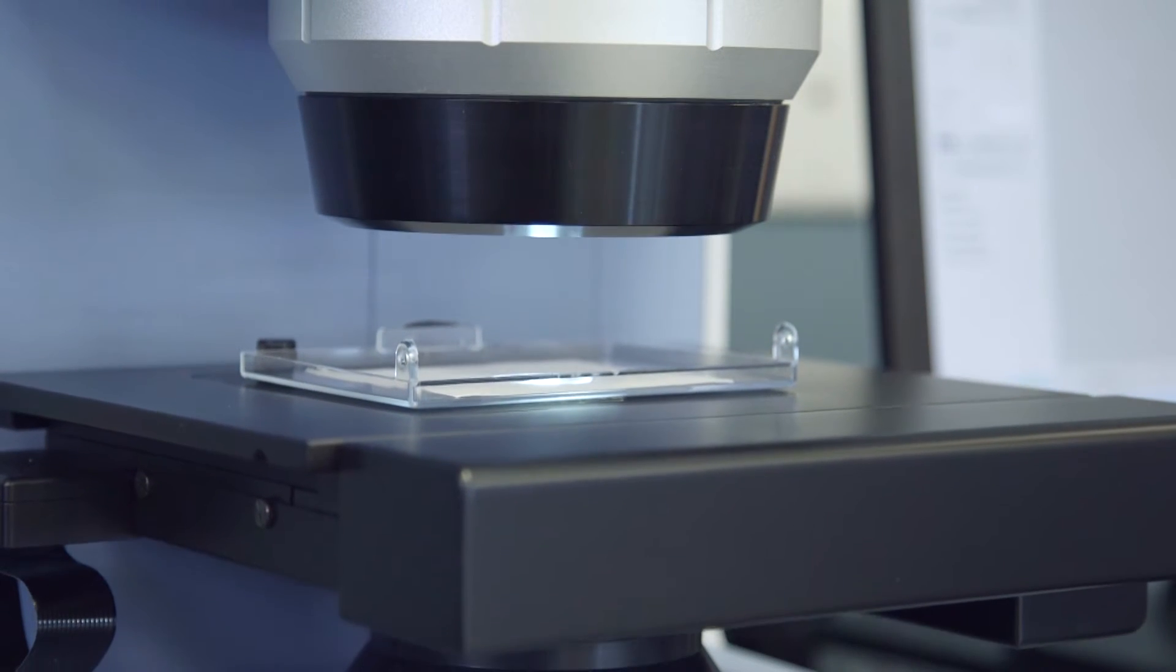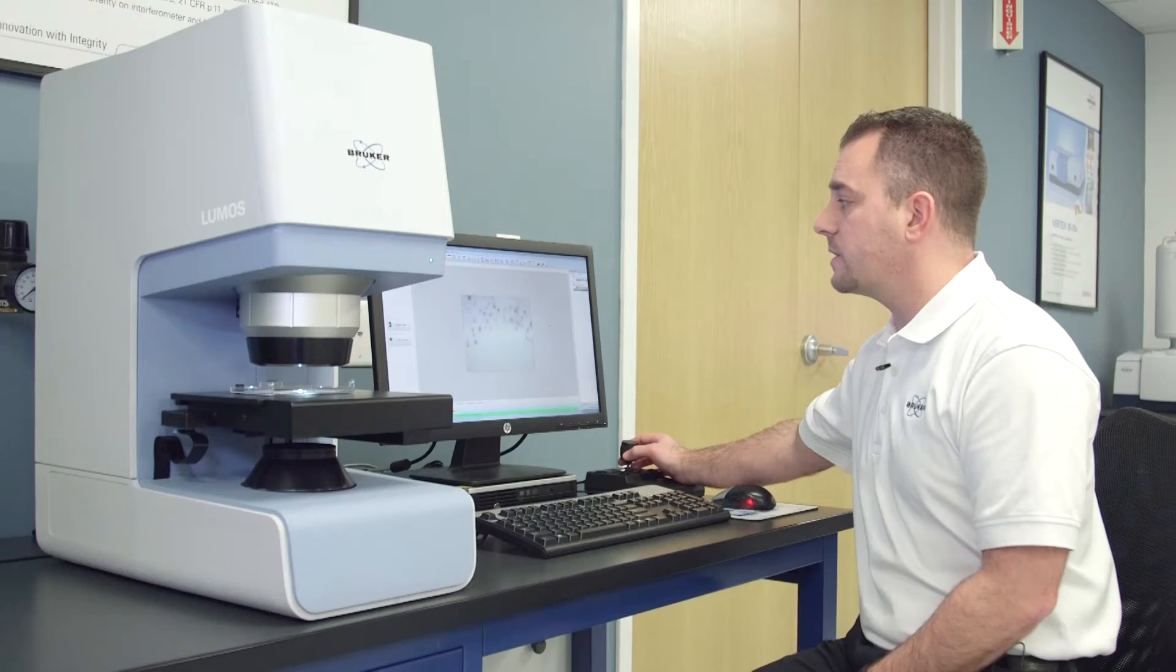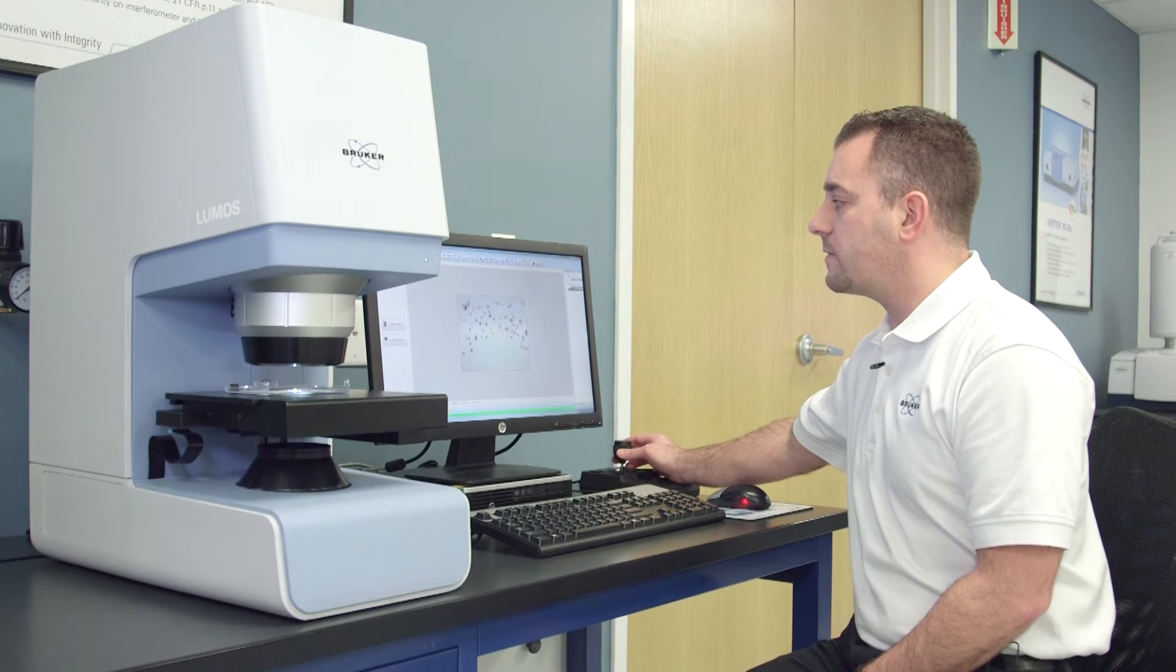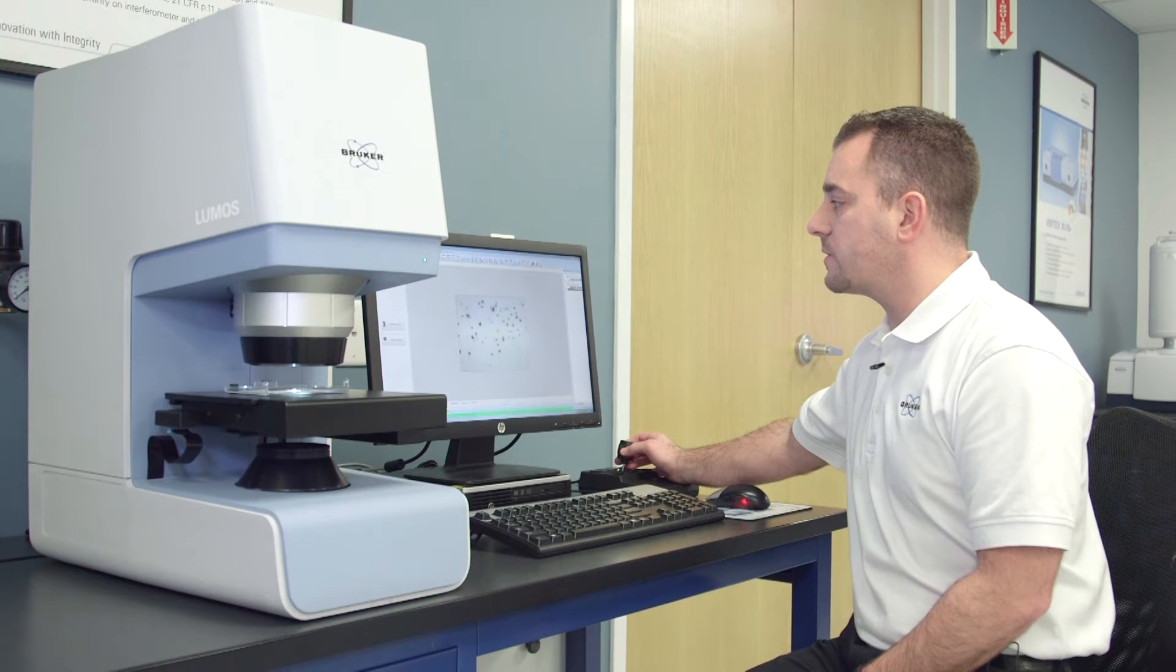Now from here I can use the joystick and if you can see I've identified a whole bunch of different particulates on this filter paper.